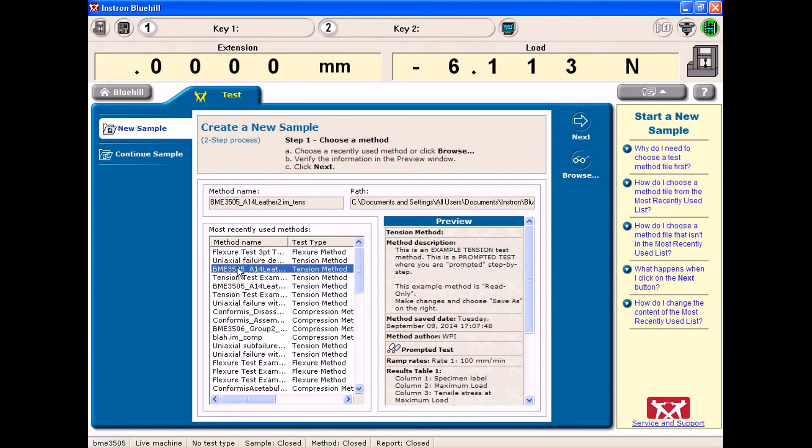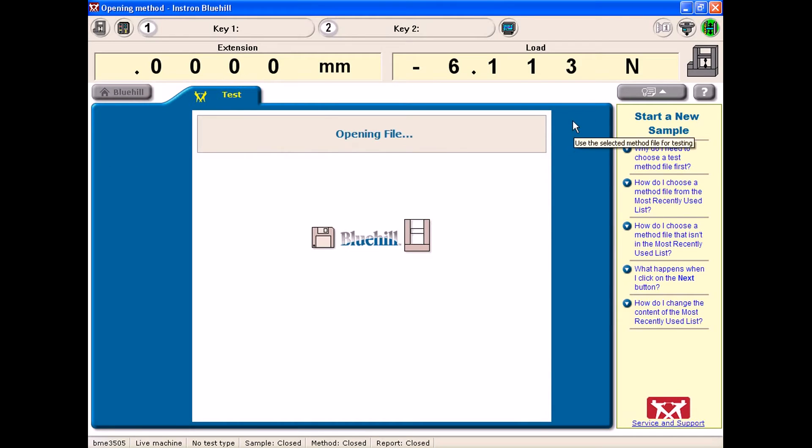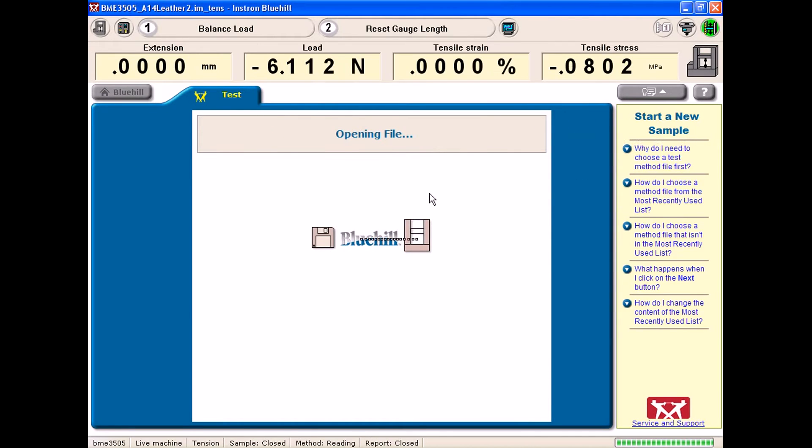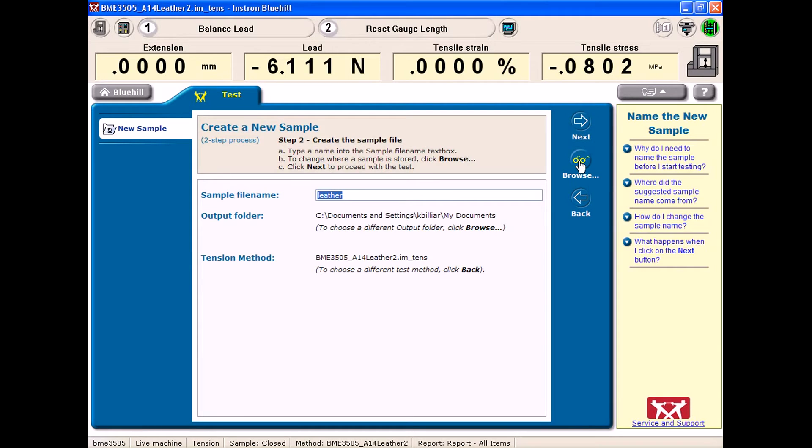I will choose this Leather 2 example from class. This is where you can create your file name as well as your output folder. In order to change your output folder, you want to make sure you go to browse and that will allow you to do that. I would suggest saving files to a specific folder that you have on your desktop for ease of use.